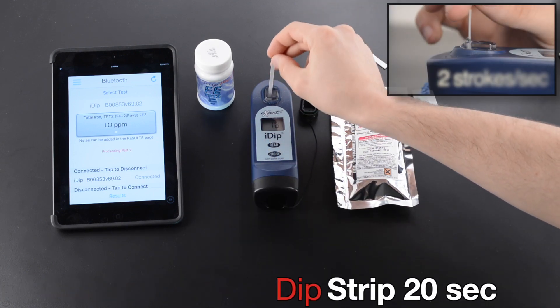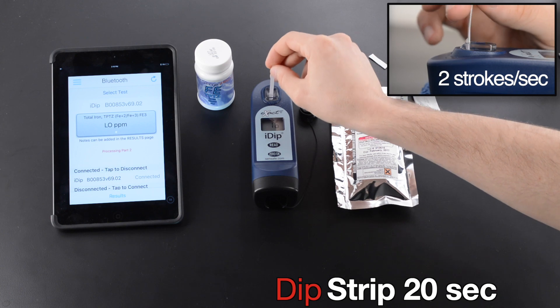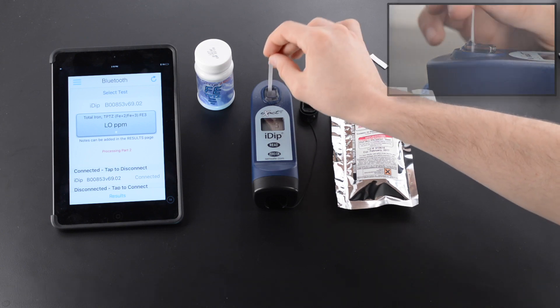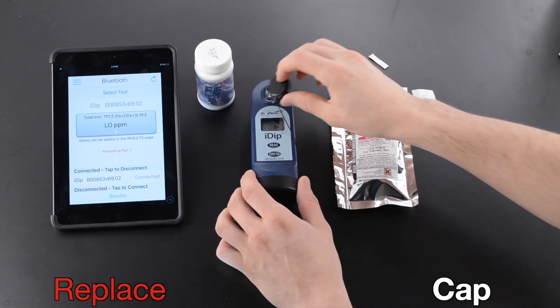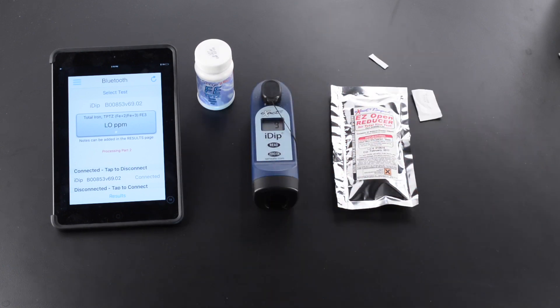Dip strip for 20 seconds — two strokes per second. Remove strip at 1 second. Replace Cap. Wait 40 seconds.